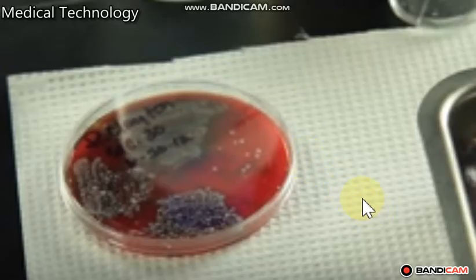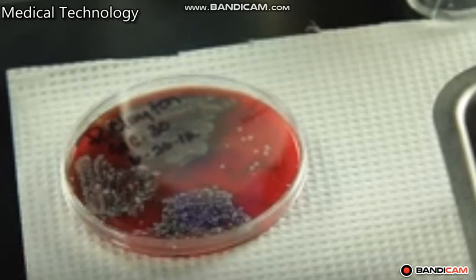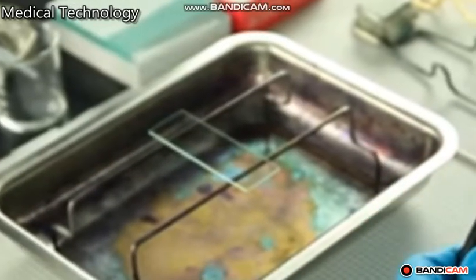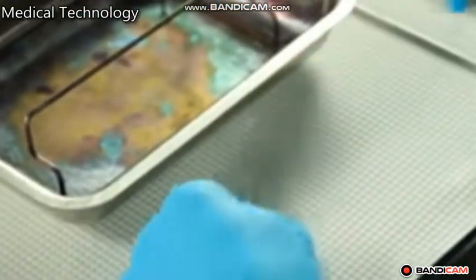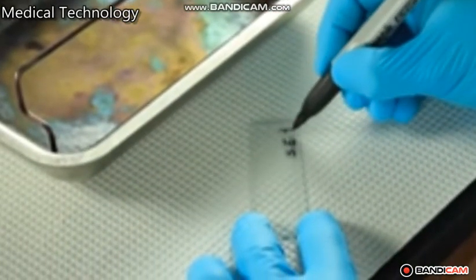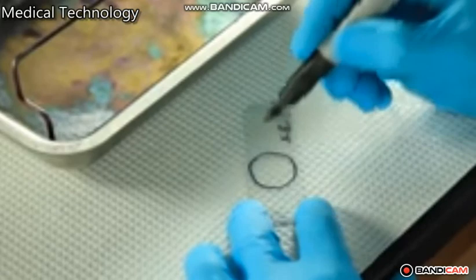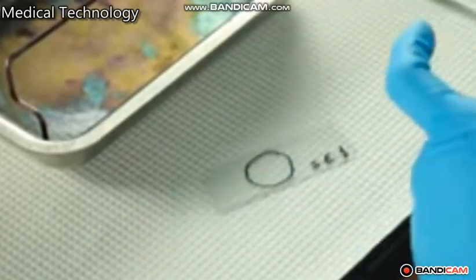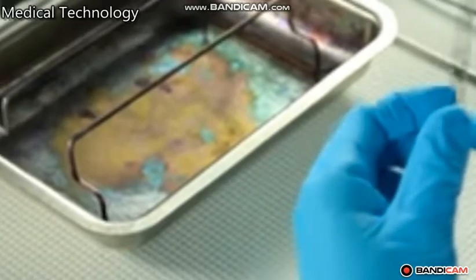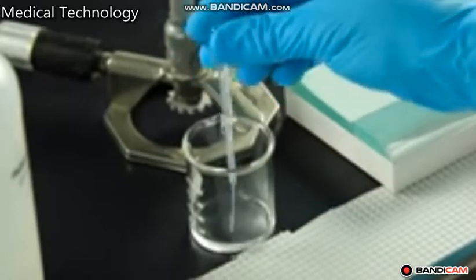Now we can watch this video about how you can stain the bacteria with simple stain. Firstly, you must draw a circle on the back of the slide and then put it on the staining rack.